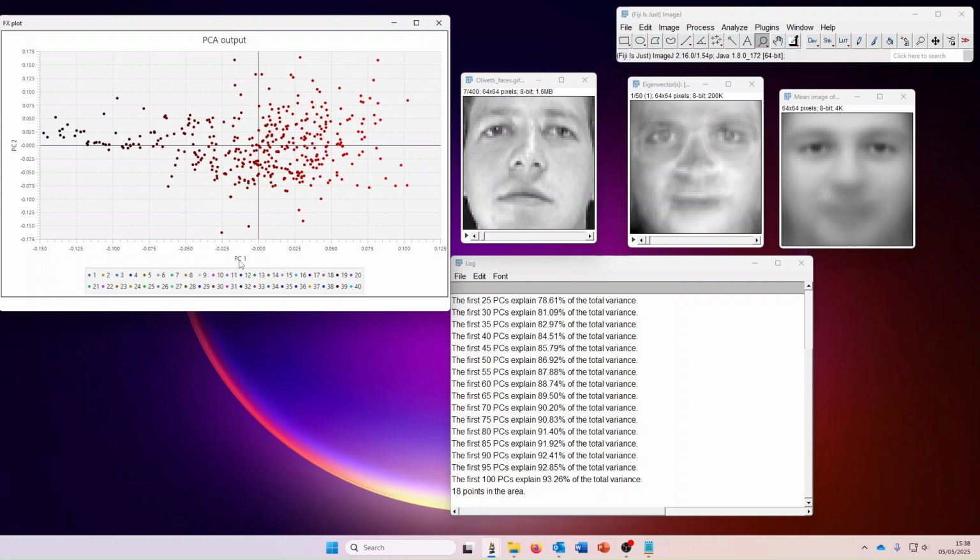It doesn't just have to be the principal components that we've already got there. So we could recolor by principal component and pick 3, right? And now suddenly we've got almost like a 3D representation, because we've got principal component 1 on the x-axis, principal component 2 on the y-axis, and then principal component 3 represented as the color differential here. And we can keep going, right? We can obviously go to principal component 4, etc. Once that's been recolored, we can then restore the color back to whatever it was originally. And you can see that's only highlighted if we've tried to change it here.